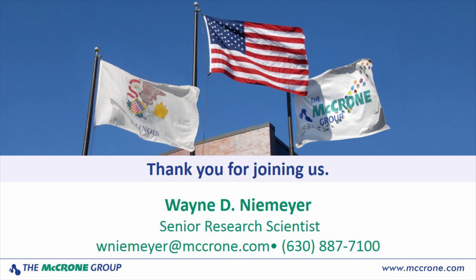And Shane, you say, why do we call things staining in light microscopy? As you said, it really isn't staining. Yeah, I called it optical staining. That's what we refer to it as over the years. And it's called staining like that. It's kind of in quotes because we're changing colors. We're manipulating colors based on how we rotate the filters in the microscope system. So it's a color change based on orientation of the crystals, orientation of the various filters that we're using in the light paths and so forth to change colors.